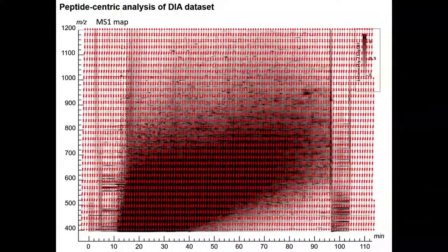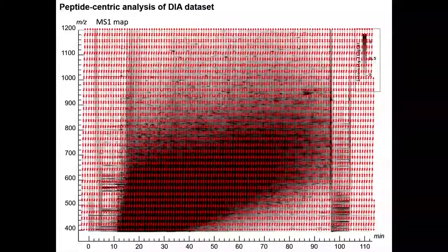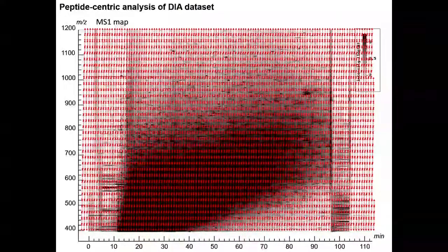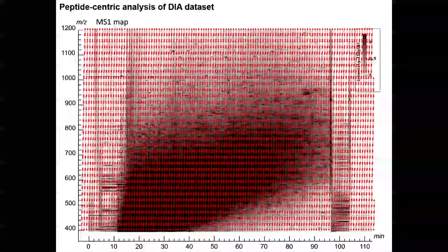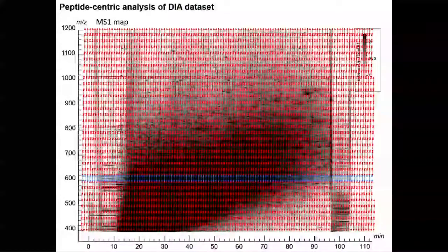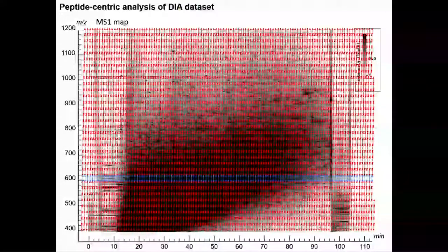And so this is a DIA acquisition scheme that you can see. Here, each of these red arrows corresponds to an isolation window. And you see that once you span all the mass range of your sample with a certain cycle time, as Mike mentioned, you basically cover the complete retention time and m/z space of your sample. And what you can do now is select one of these mass ranges, for example, this mass range from 600 to 625. So this is what we used to call a SWATH. It's the set of isolation windows that span the entire retention time.